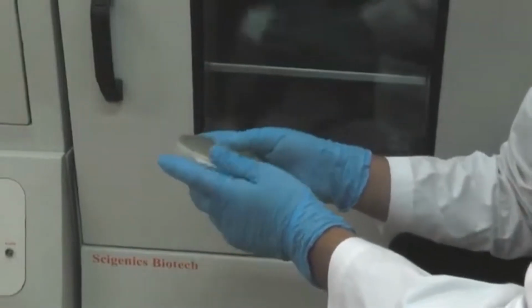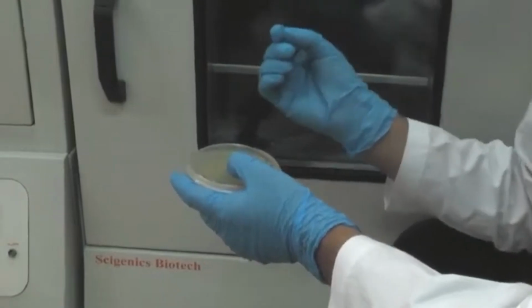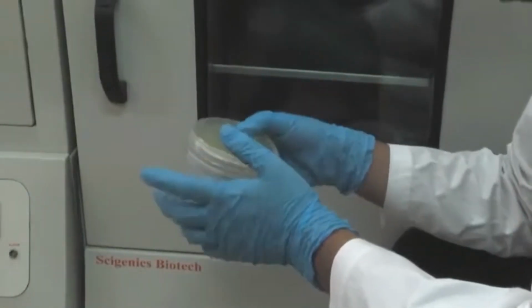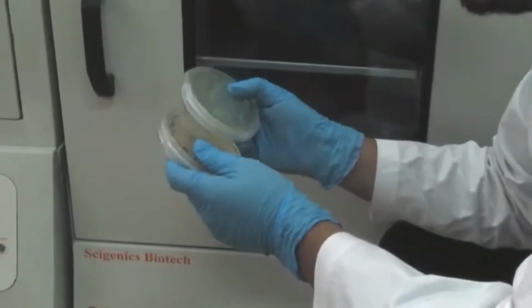It is very good practice. In fact, it is almost mandatory to take perfectly single colonies when working with such bacteria. So, that is one point that you need to ensure.